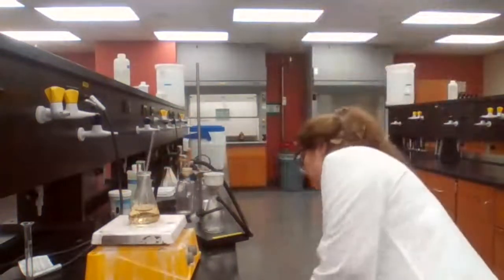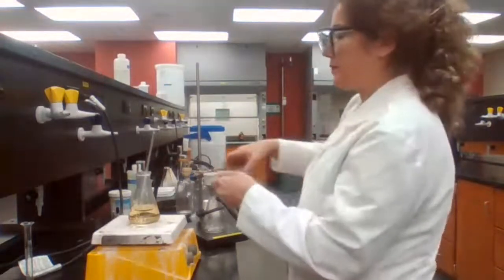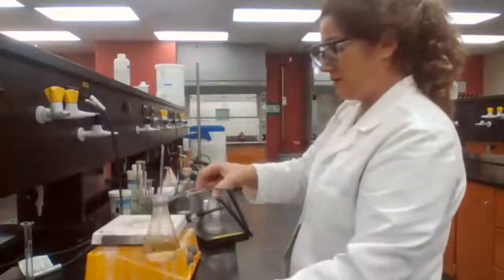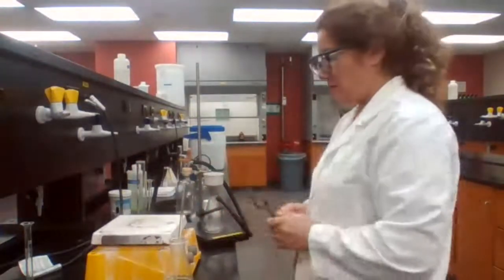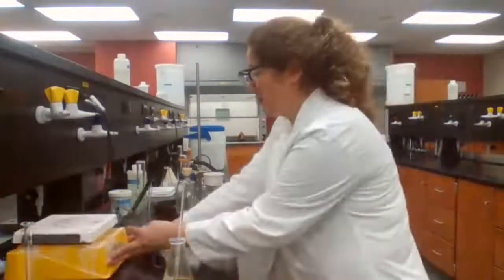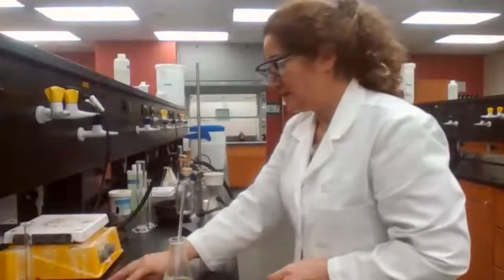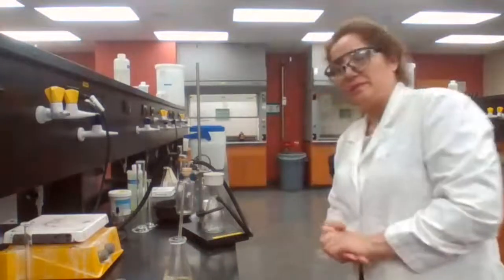And now take it out and place it on the bench top. Turn off the hot plate. I don't need the hot plate anymore. And wait until I see some crystals forming.